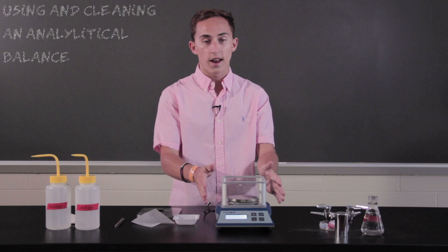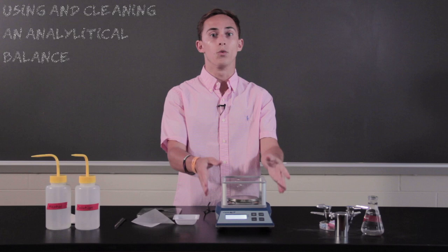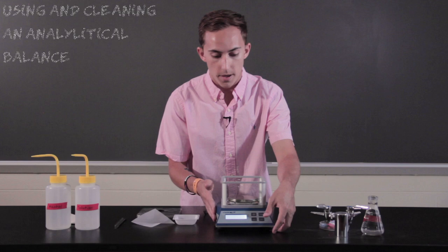So now that I've shown you how to use an analytical balance, now we're going to learn how to clean it properly, and how you'll store it.